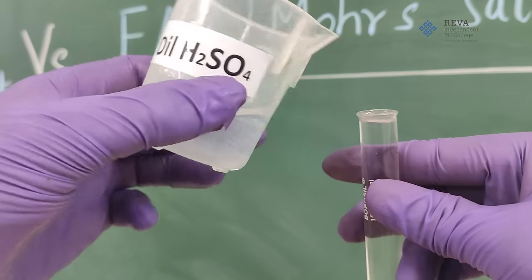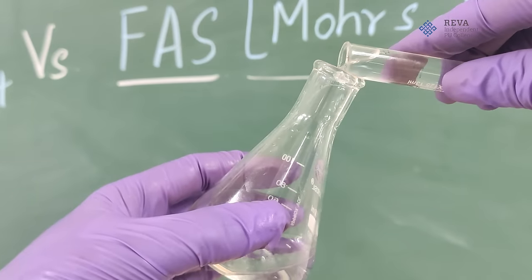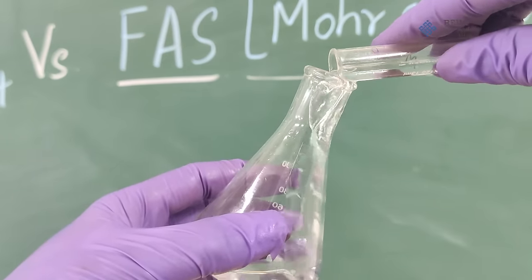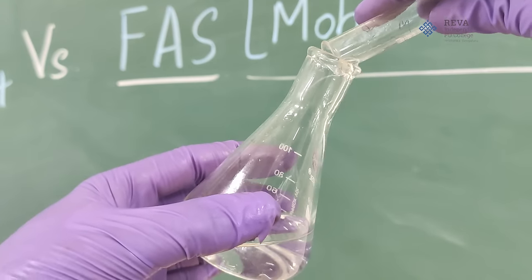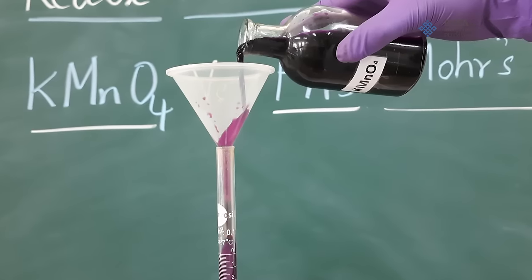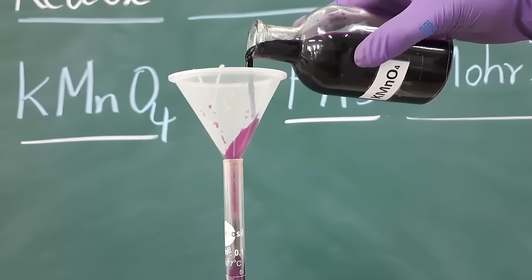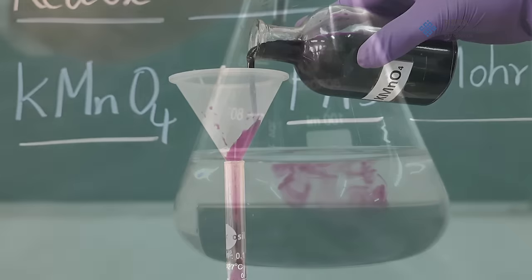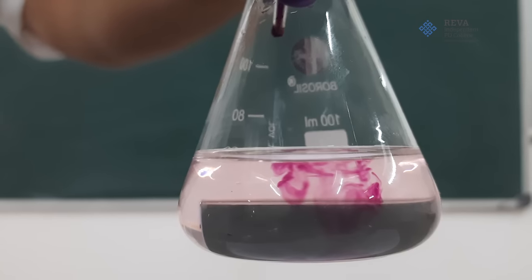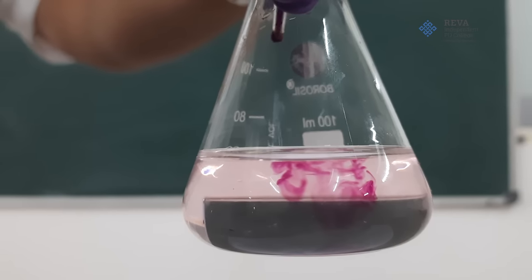Now to the conical flask, add one test tube of dilute sulfuric acid which acts as acid medium. In this experiment, we are not using any external indicator since the potassium permanganate solution itself is a self indicator as it is colored.